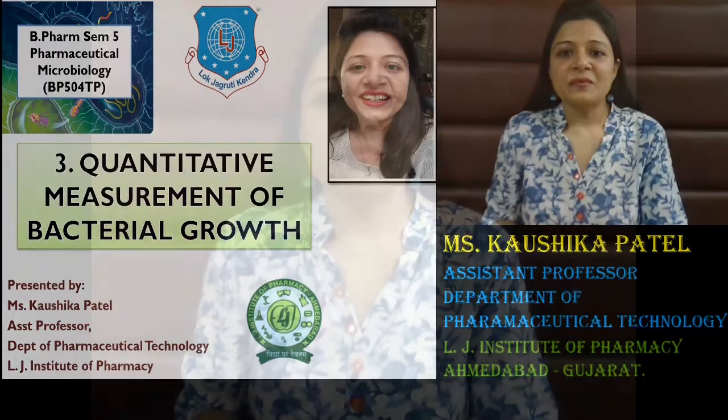And today we are going to study the different methods for the quantitative estimation of bacterial growth. In the previous sessions, we understood what a bacterial cell is and what the difference is between a bacterial cell and a eukaryotic cell. Now, when there is growth in the bacterial cell, how can we measure the growth rate in a sample of bacterial cells? So let's begin with our session.